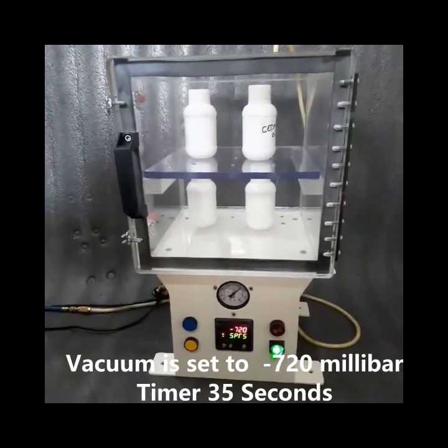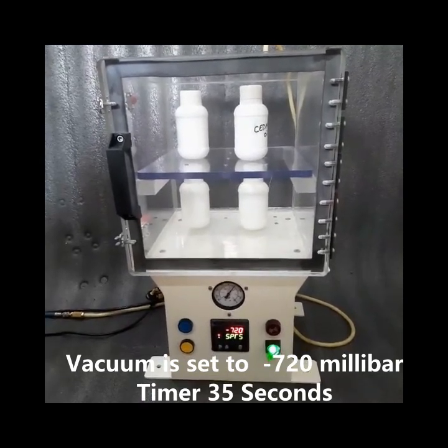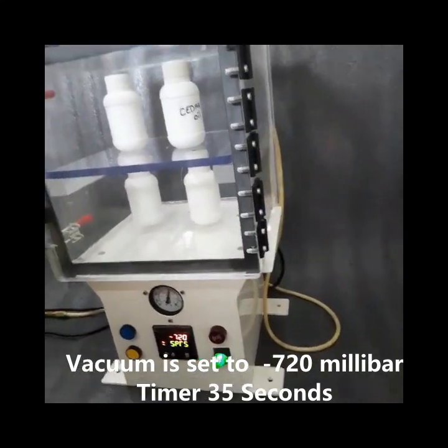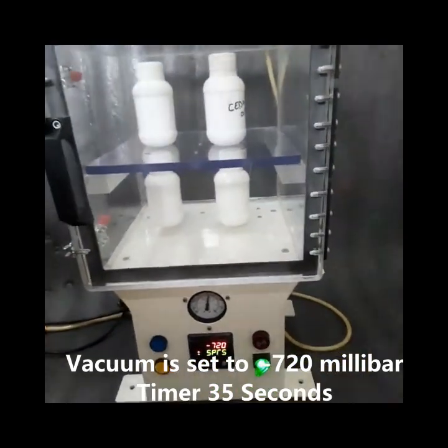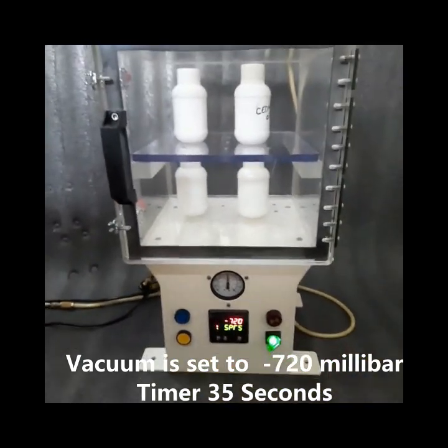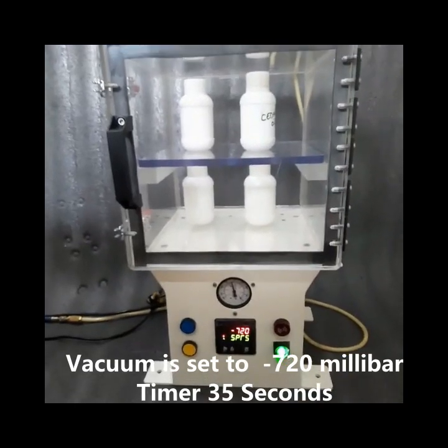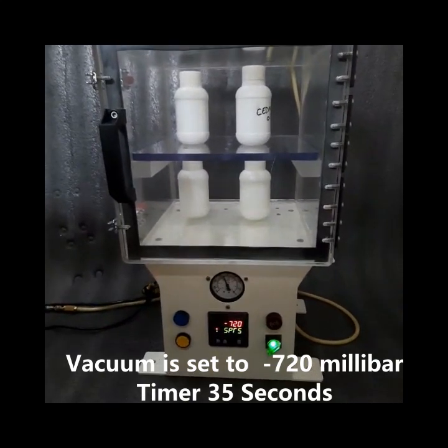You can see that the dial of the vacuum gauge is moving in an anti-clockwise direction, showing that the chamber is moving into vacuum. The process is going on, with the gauge showing towards minus 650 mbar.